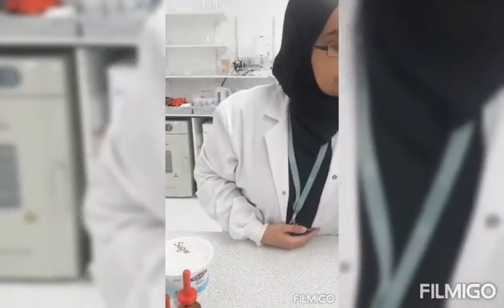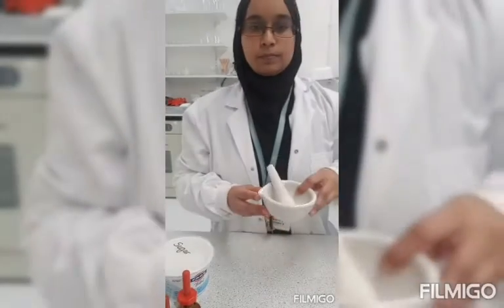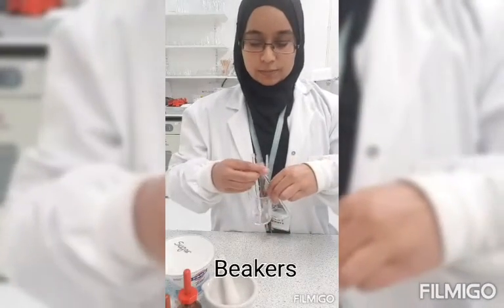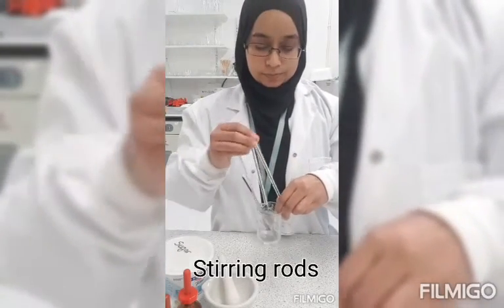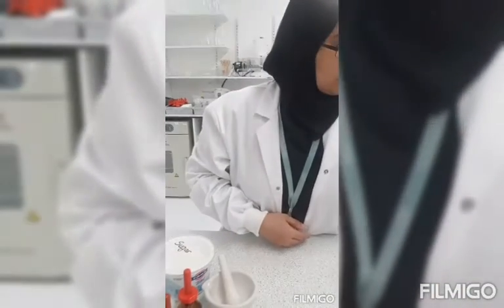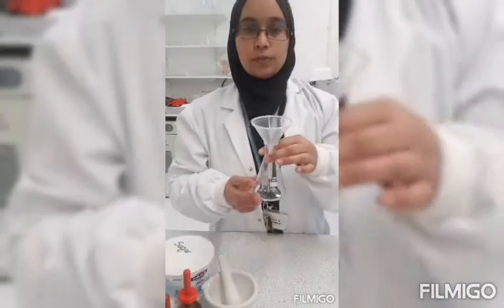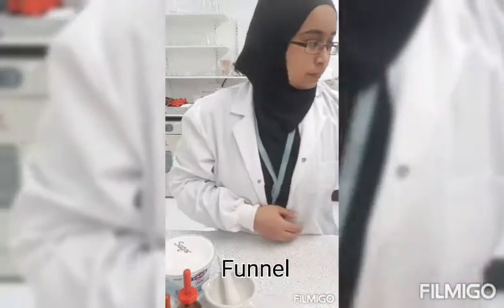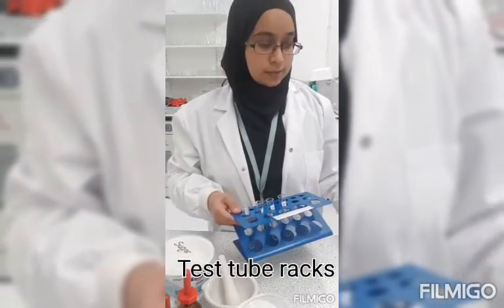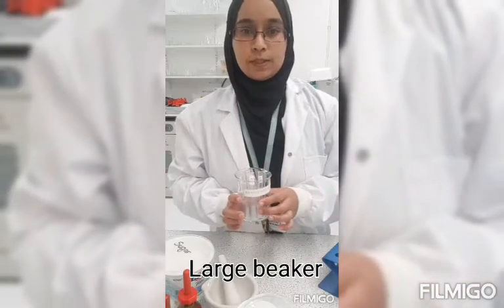You'll also need some distilled water, a pestle and mortar, a couple of beakers, some stirring rods, some spatulas, some pipettes, a conical flask, a funnel, filter paper, some test tube racks and test tubes, and a big beaker.